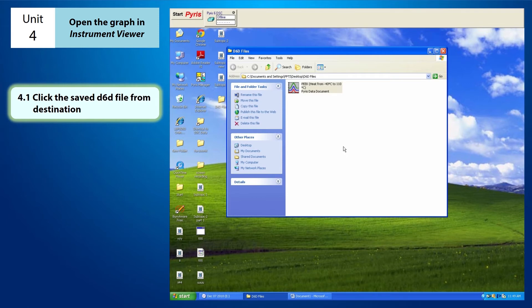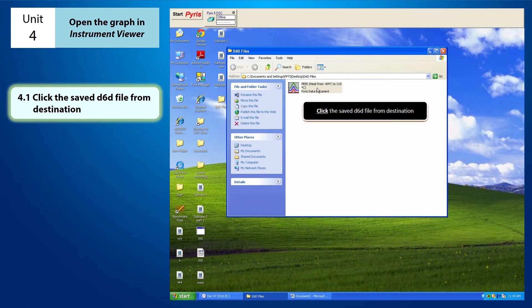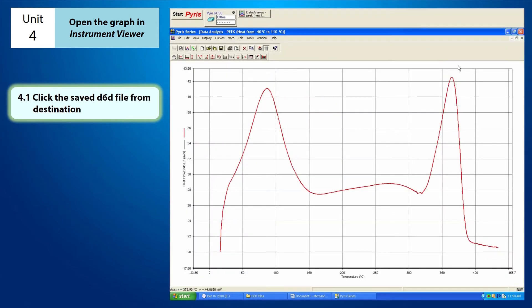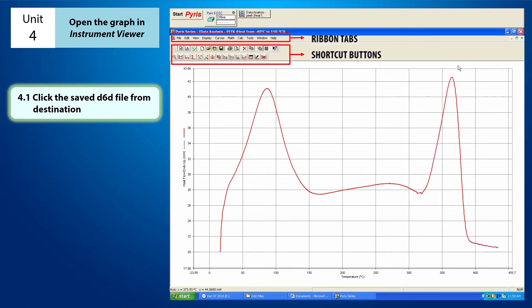Then, I just have to click on the D6D file that I had saved before. Instrument viewer allows you to view and do a calculation on the graph. As we can see, on the top of the instrument viewer, there is a ribbon tabs and shortcut buttons beneath it.